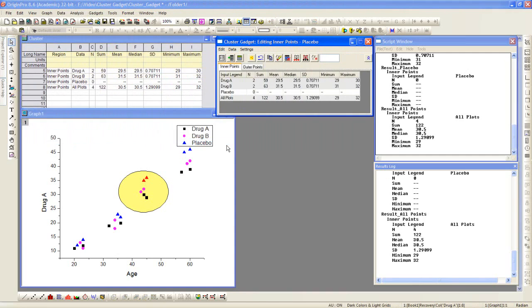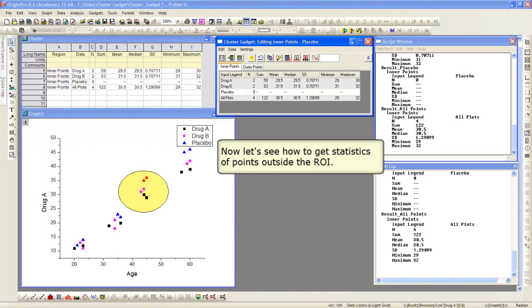And also it will append, it will create new rows and append those to the cluster workbook. Again, you can compare what we see inside the cluster gadget dialog itself with what is reported in the newly generated workbook there, cluster.